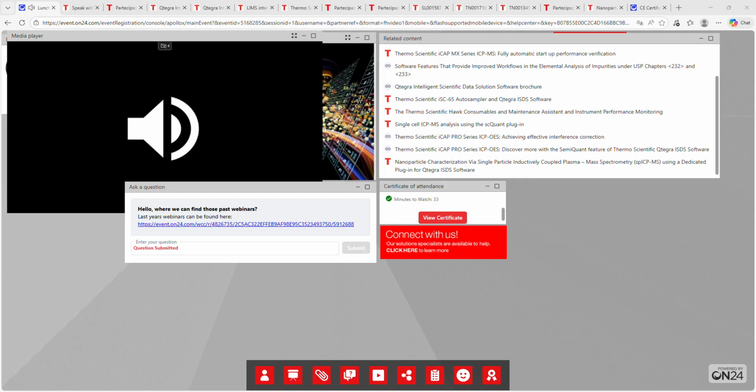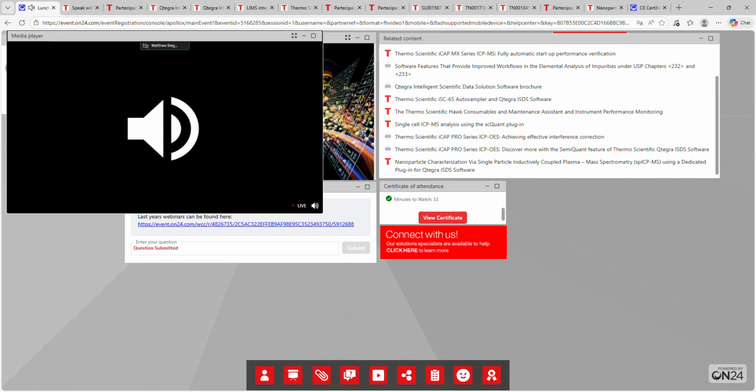Yes, absolutely. So within qtegra, if you're in the concentrations page, there is a cog at the bottom, which essentially means the settings. So you can change various different accuracy settings, so how many decimal places for any of the settings really, so the concentrations, the intensities, the R squared, the LOD, things like that. So you can just change them within the lab book there.